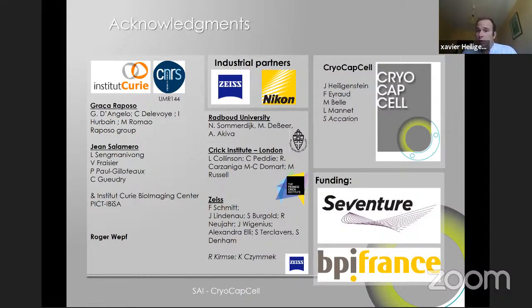But if you're doing chemical fixation, which is also something extremely broadly used, you can use MatTek dishes, which are laser-engraved Petri dishes. And then the same applies, you will have to see I'm in B2 or in K4. We've seen some examples in Claudio's presentation before. But you need landmarks to find back your cells. Otherwise, nothing looks more like a cell than another cell. It could be difficult, yeah.